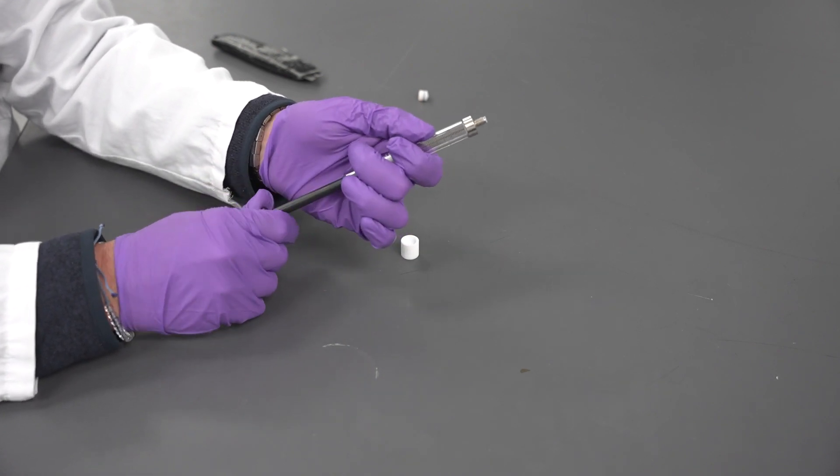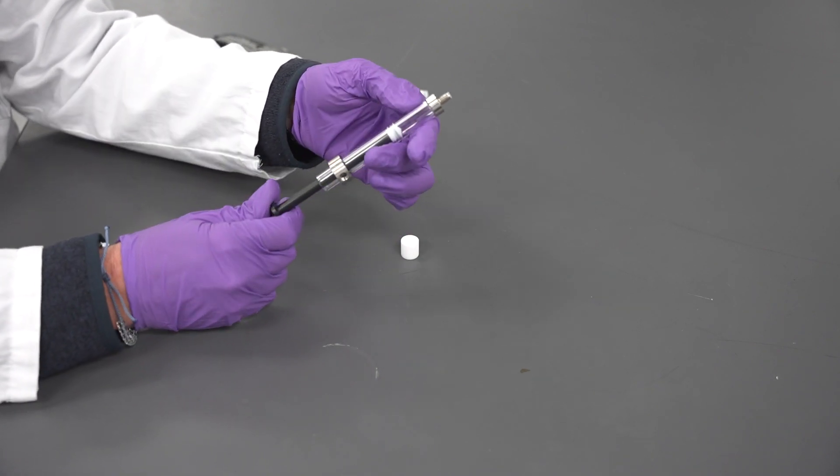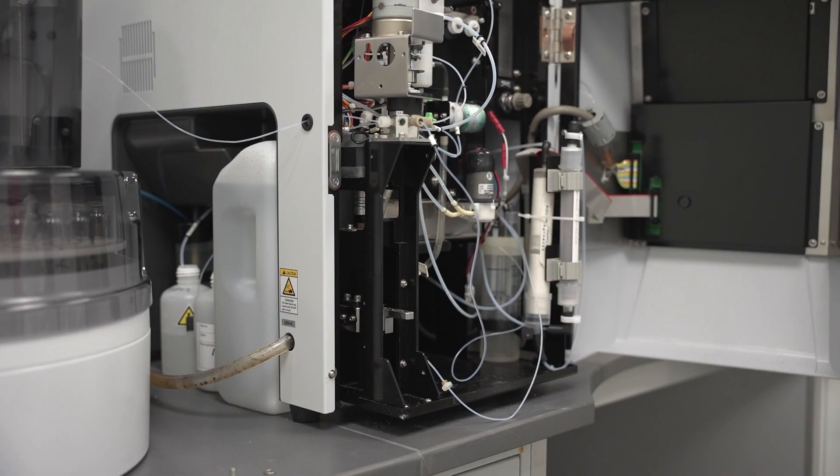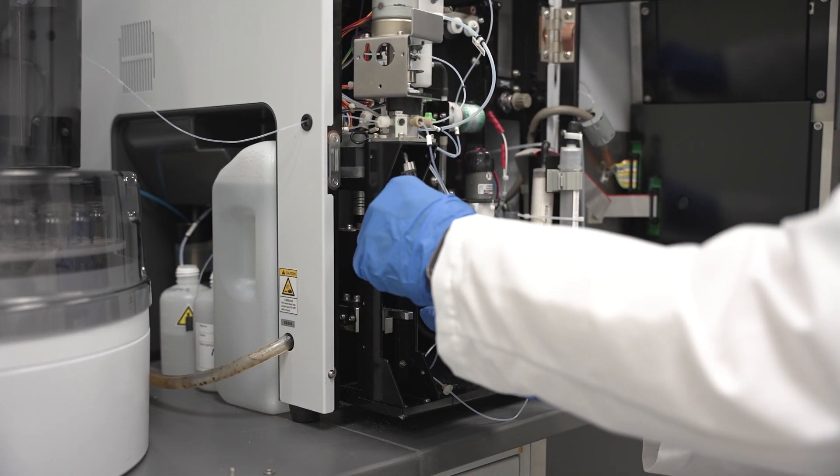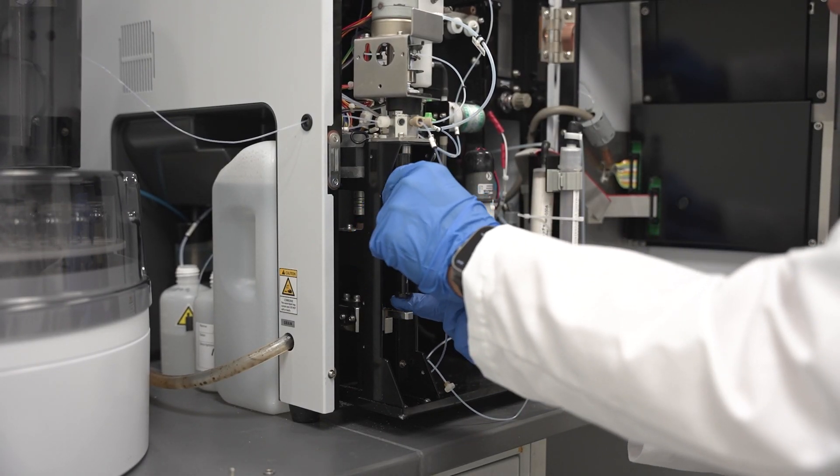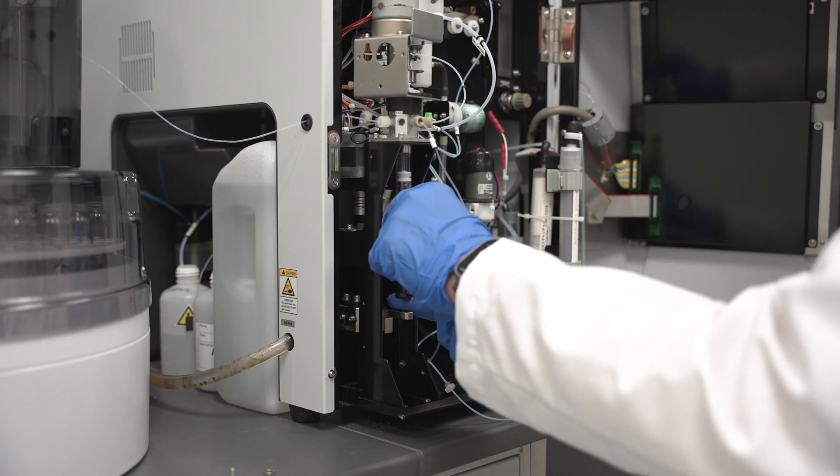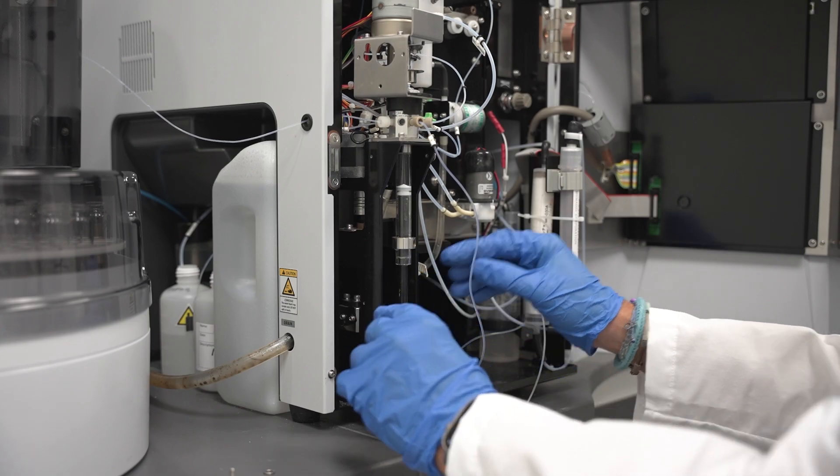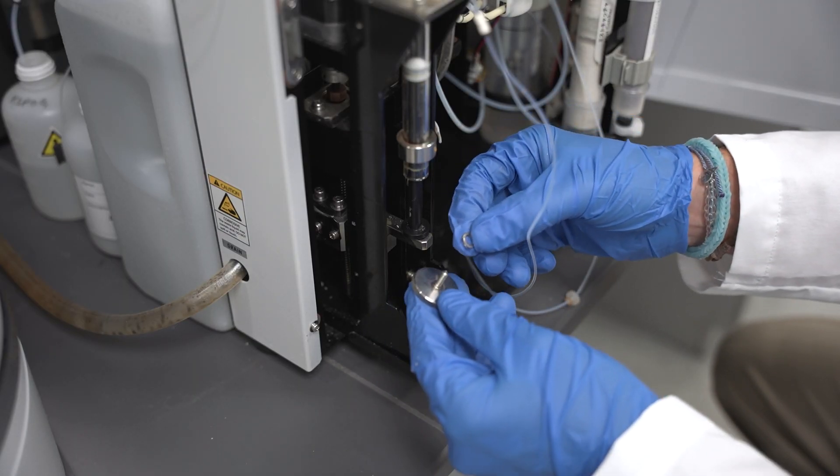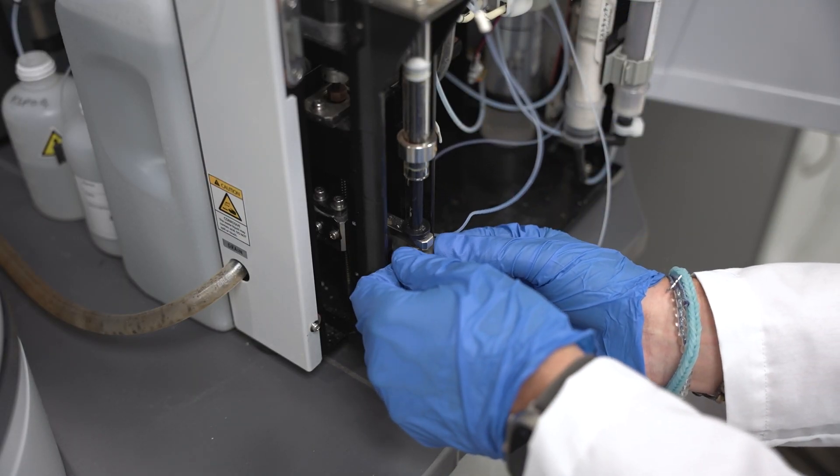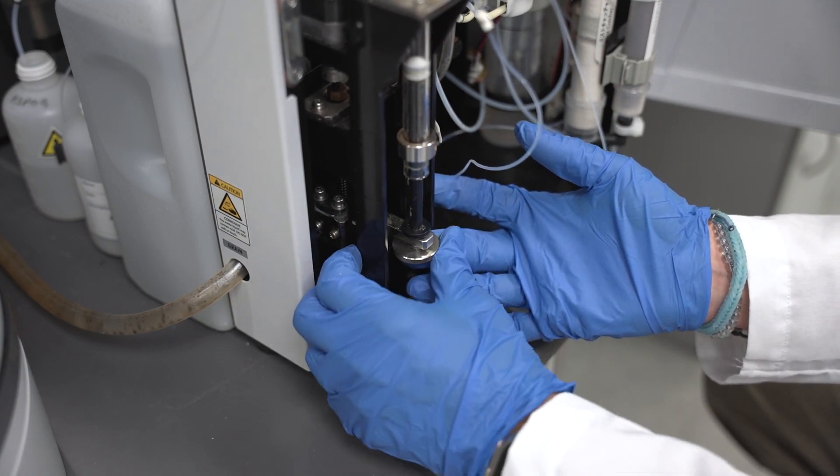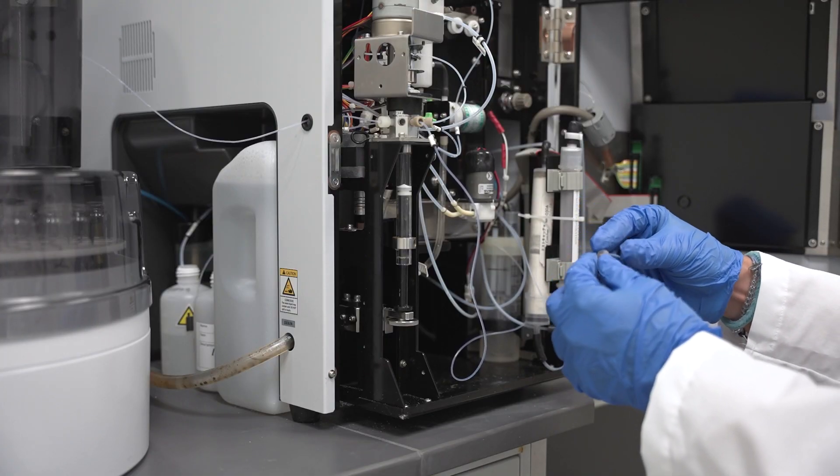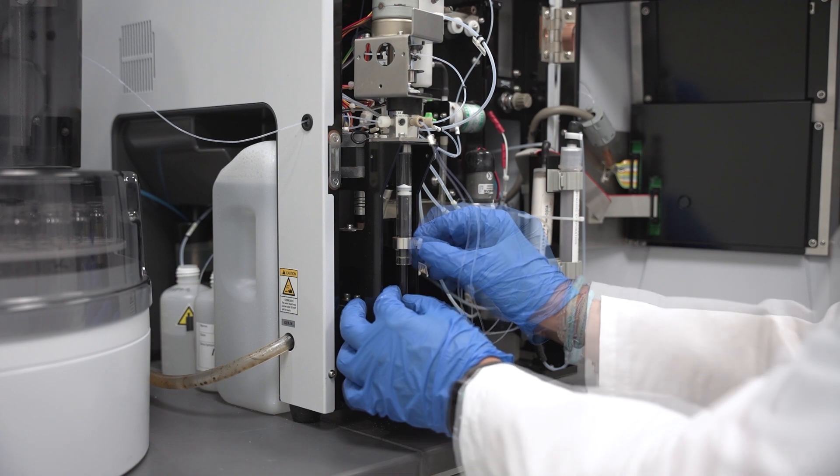Re-insert the plunger into the barrel of the syringe and then screw the syringe back into the valve. Finally, replace and tighten the retaining screw to secure it to the drive arm. Reconnect the sparge tube to the syringe.